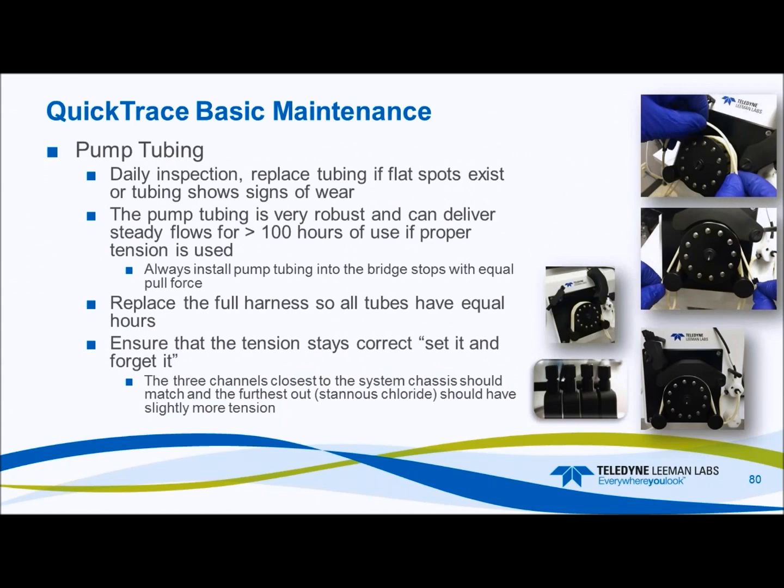Pump tubing, inspect it daily. It's pretty robust. It's going to last for 100 hours. Always install into the bridge stops with equal pull force. Replace the full harness. Don't just replace one tube you think is bad, because you're asking for problems. So replace the full harness. Ensure that the tension stays correct. Set it and forget it. Don't adjust it. Just let it go. Change the tubing harness if you spot problems with the pump tubing.